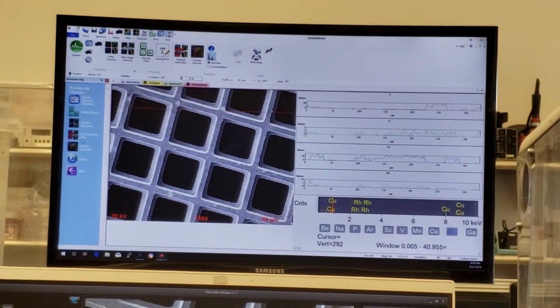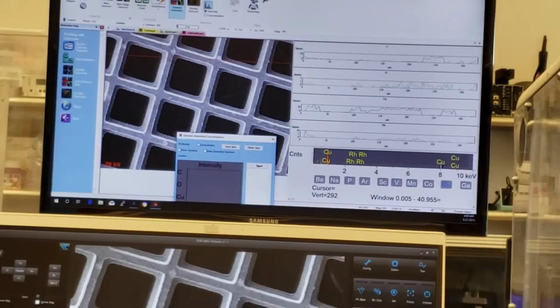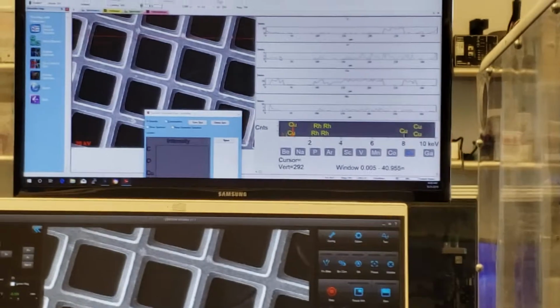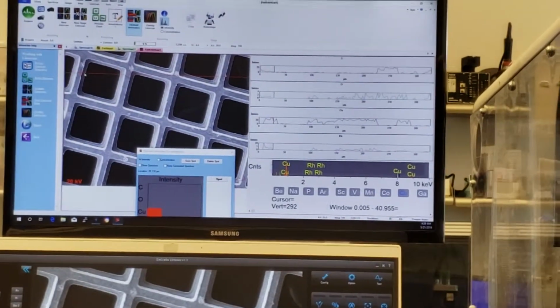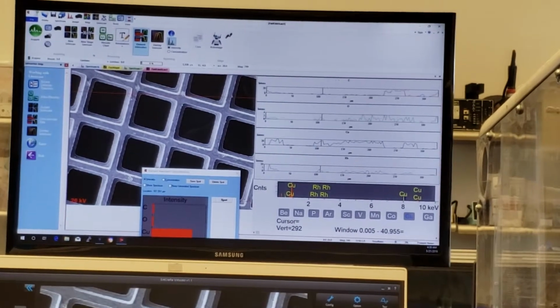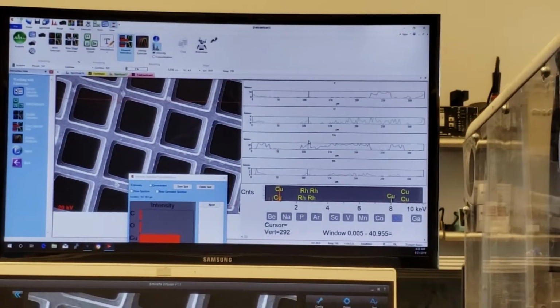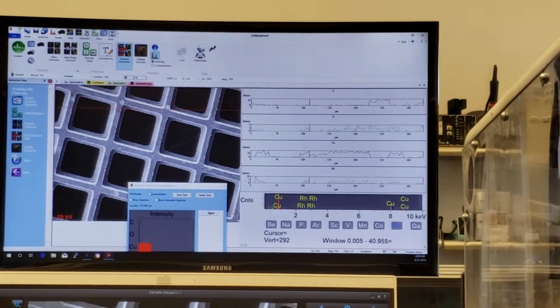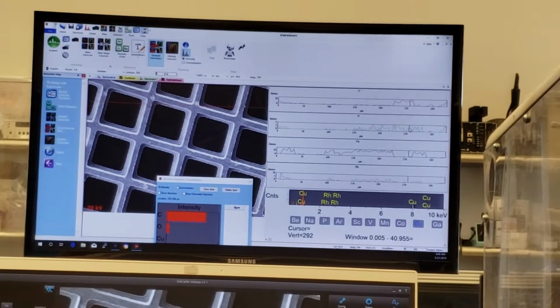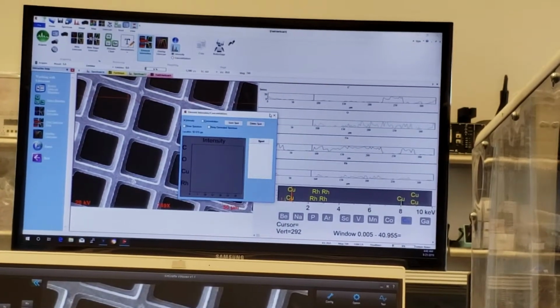So in my line scan, if I go view line scan data, if I move this window down, it's a flowchart, just like view line scan data. So if I start to the left, if I left click in any one of these windows, see how it throws up a hash mark? If I drag that, it follows the hash mark right there, I should be highest copper. Where's copper? Copper's here, so copper should be high. It is, right? So if I keep following this line, like right there, it's saying, oh, carbon is high, great, right? So it's following along the line scan. So it's a nice feature as well.